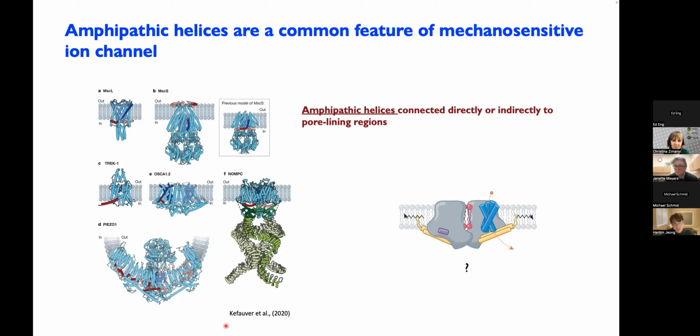So I did compare the Bioruptor method with sonication, homogenizer and French press, and the Bioruptor method is the best to preserve the oligomeric state of the TMC1 complex.